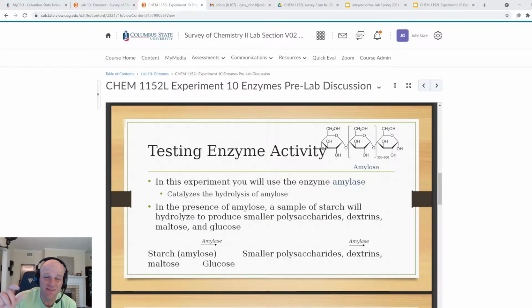Every enzyme name ends in ASE. So today we're looking at amylase. Amylase is an enzyme that hydrolyzes amylose.